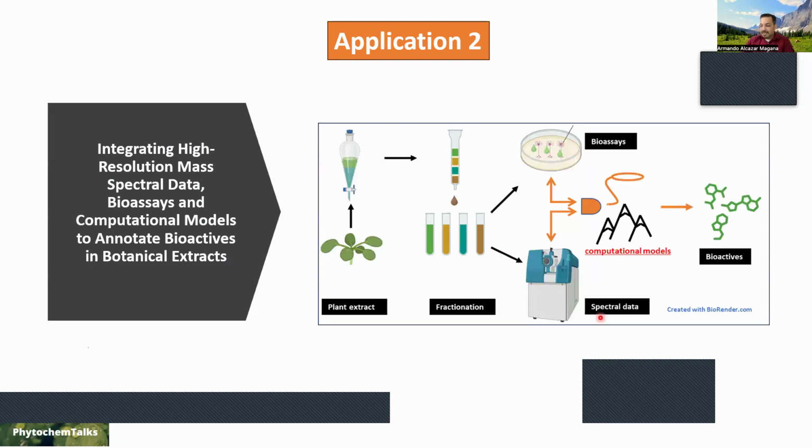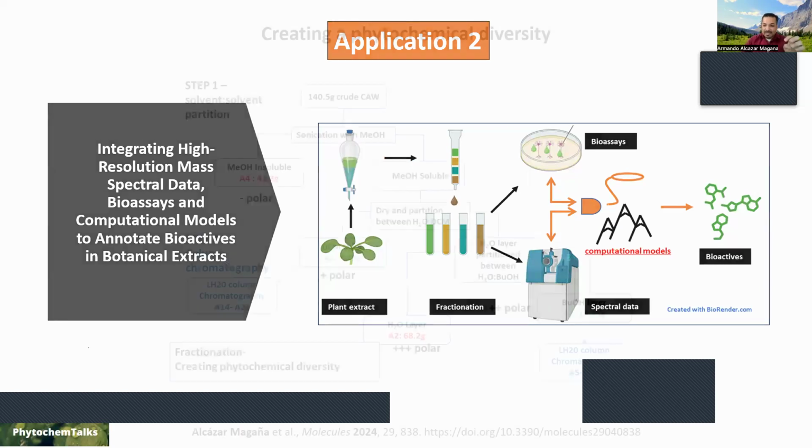Okay, that was the first application. Now I'm going to talk just a little bit about the one I want to spend more time on, because it explains how the instrument works. This is another interesting application that we developed quite recently, and it uses spectral data correlated with bioactivity assays to find the bioactive compounds.